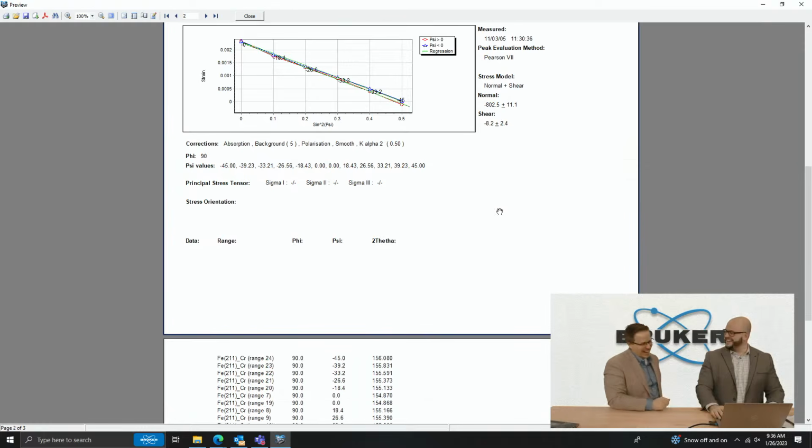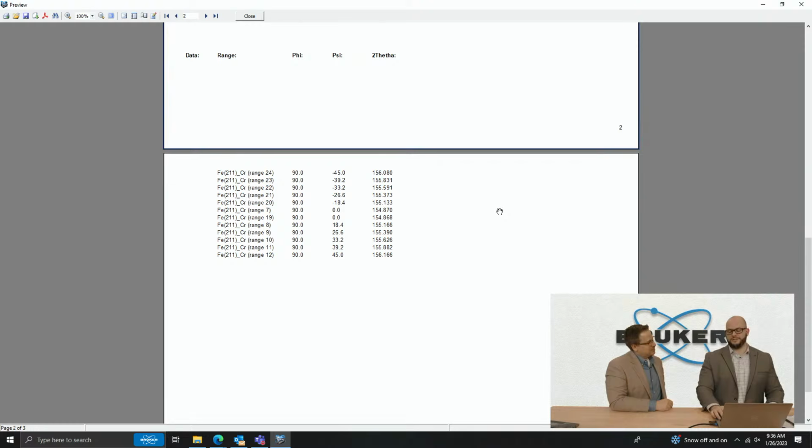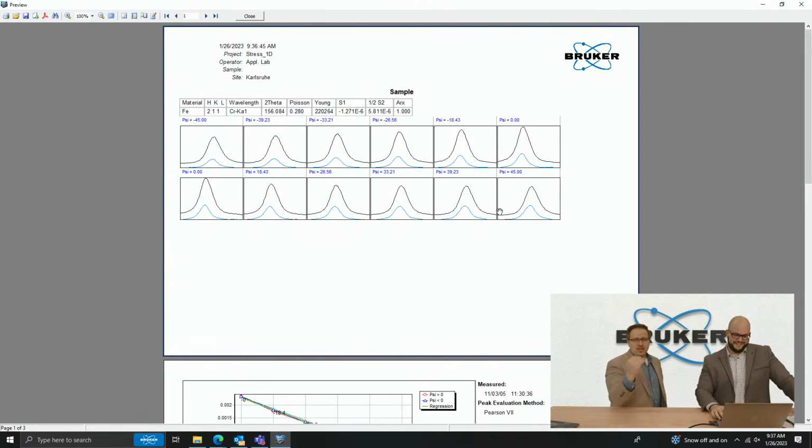You can see how it throws everything onto a nice Word document for you. And there's a nice editor in the background where, right under that same field, you can change your logo, put your company logo up there, and put the information that will display. So it's a nice way to make a report.